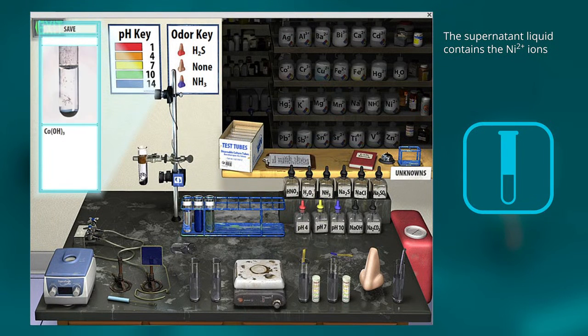It's still in the oxidized state, so if you want to take it back, you can add heat again, and that takes it to the original oxidation state that we started with. So that's how you separate them. So now let's test that.